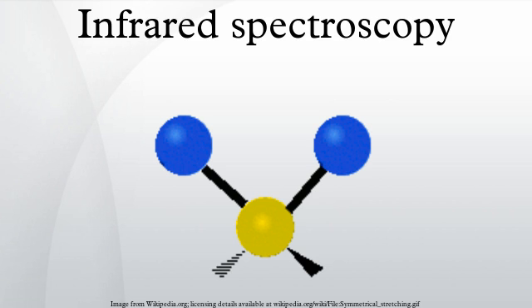As with two-dimensional nuclear magnetic resonance spectroscopy, this technique spreads the spectrum in 2 dimensions and allows for the observation of cross-peaks that contain information on the coupling between different modes. In contrast to 2D NMR, nonlinear 2-dimensional infrared spectroscopy also involves the excitation to overtones. These excitations result in excited state absorption peaks located below the diagonal and cross peaks.